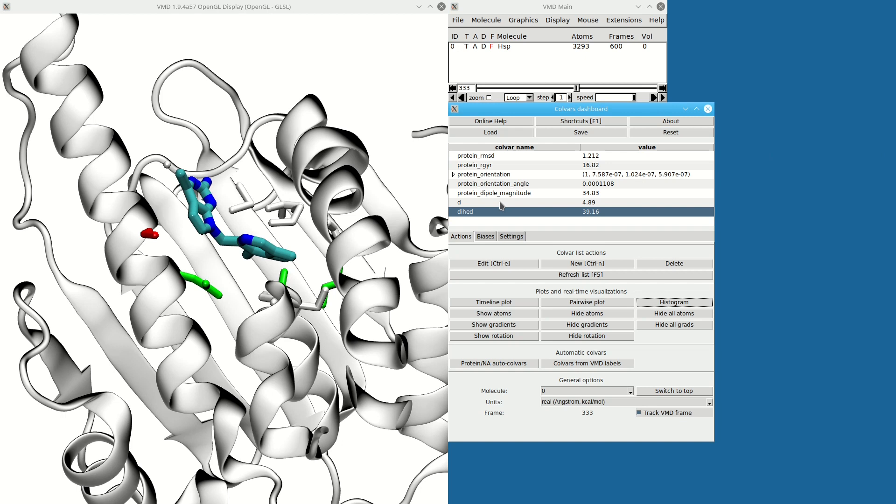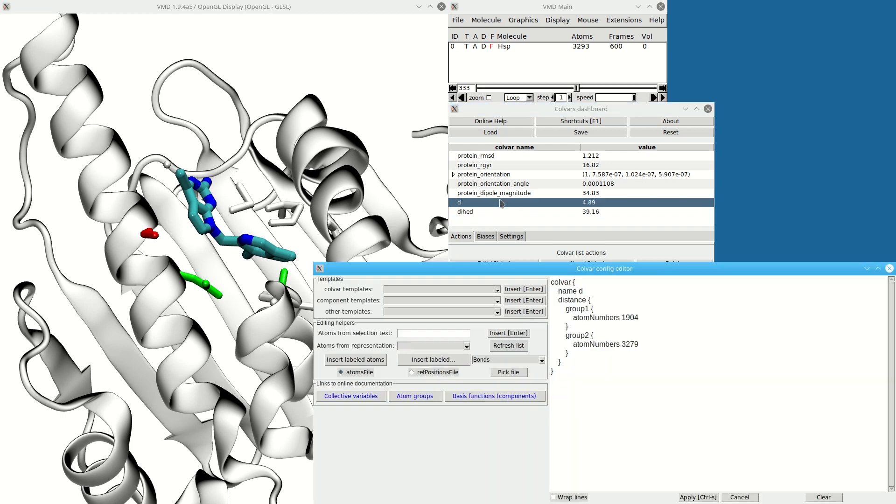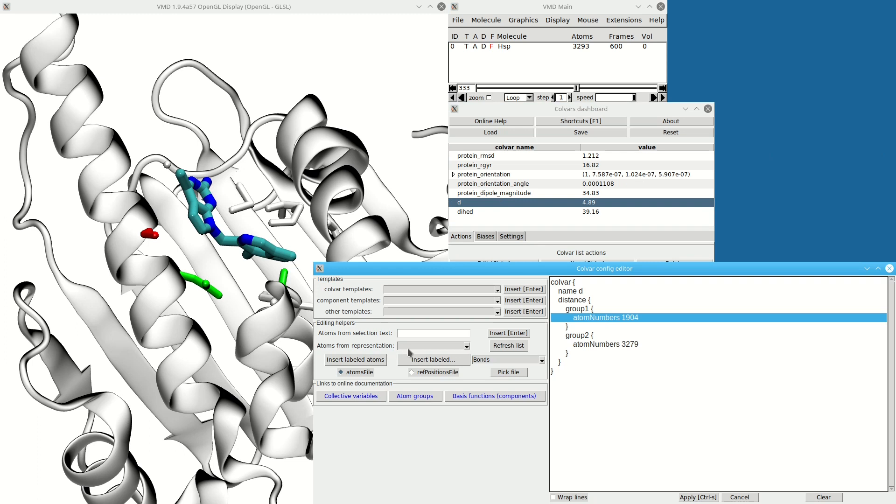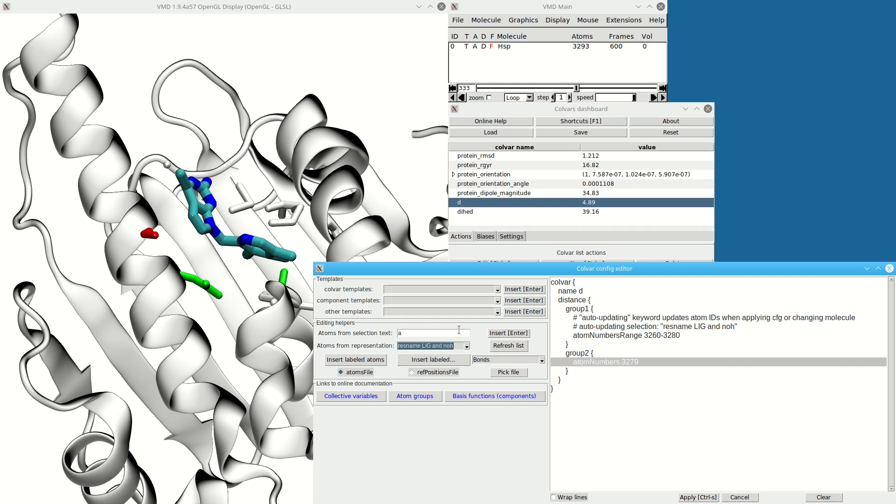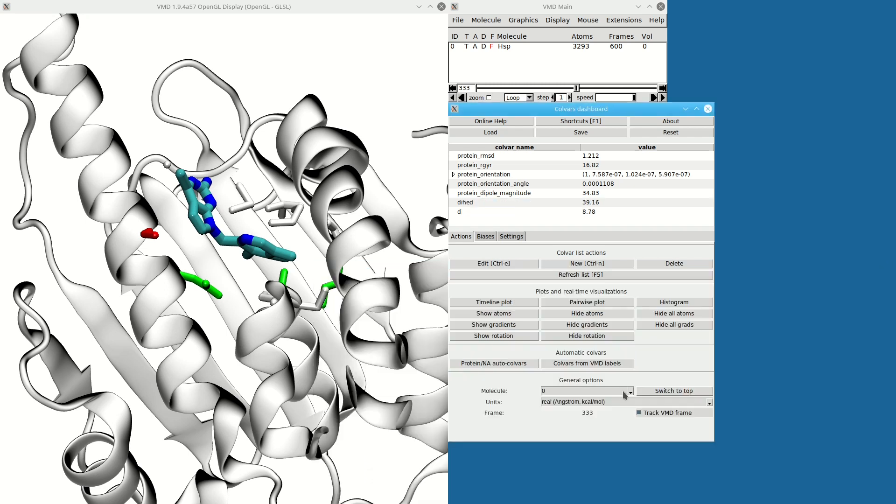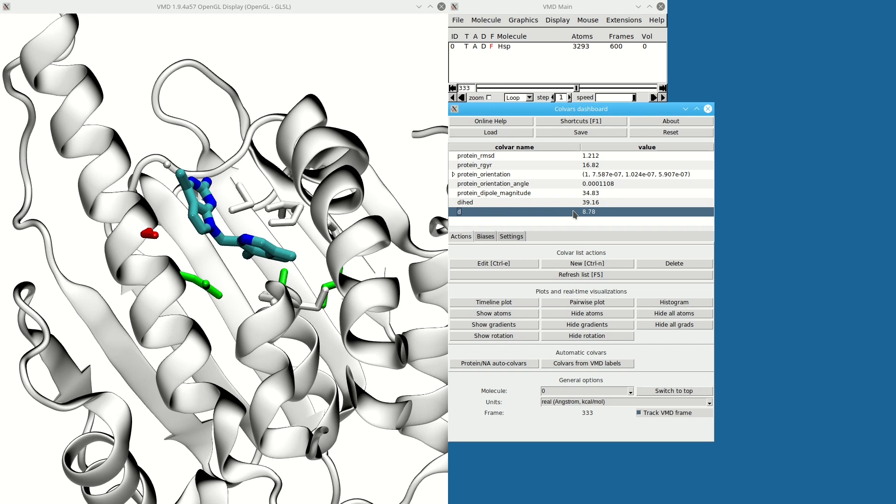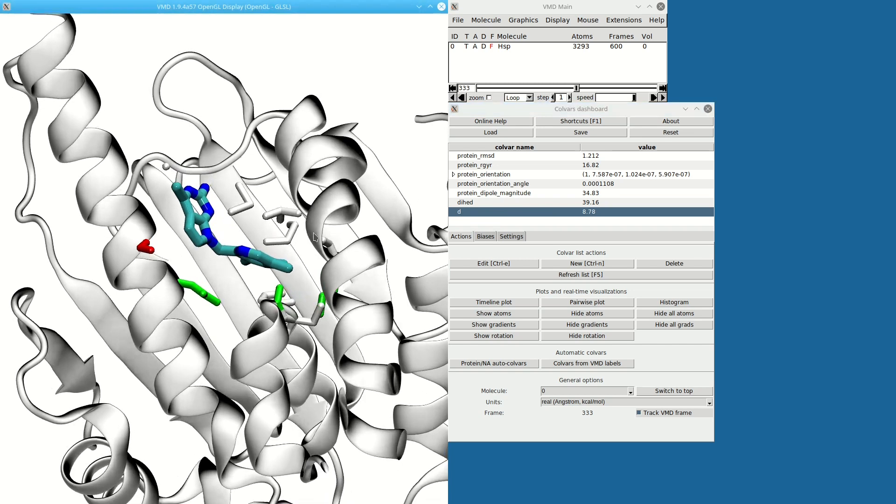Right now these variables are a bit crude—they're defined based on just two atoms. So let me instead use atoms from the ligand as used in the representation. For the protein, I'm going to use all alpha carbons, which I can select using these simple VMD selections.